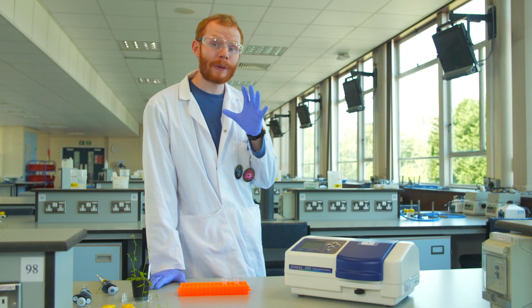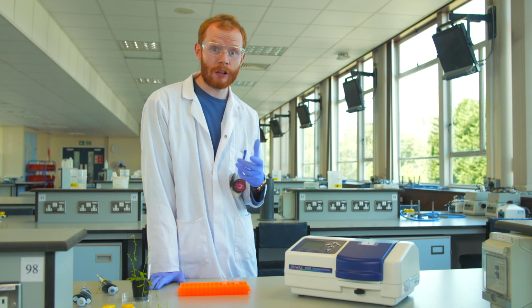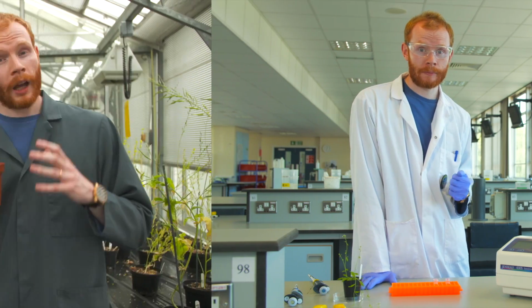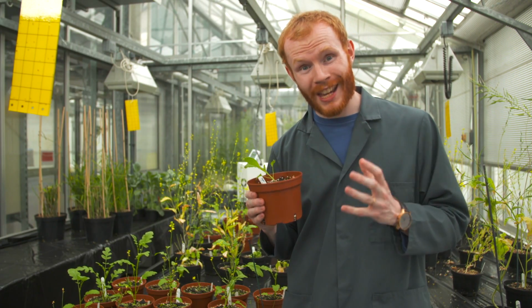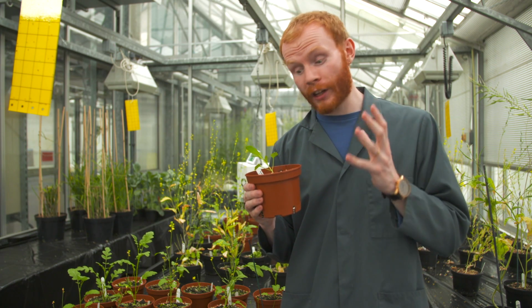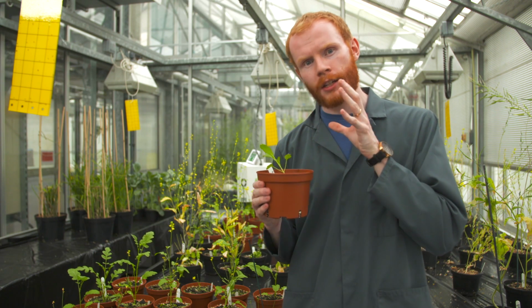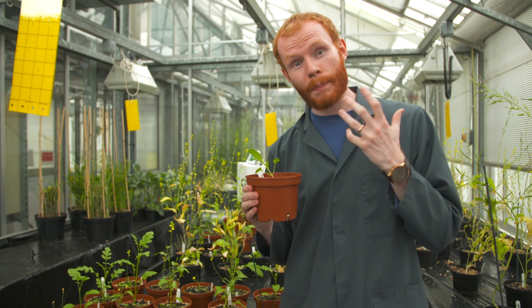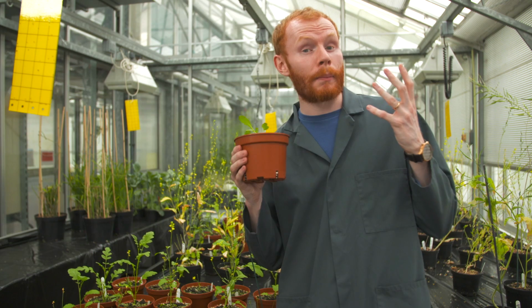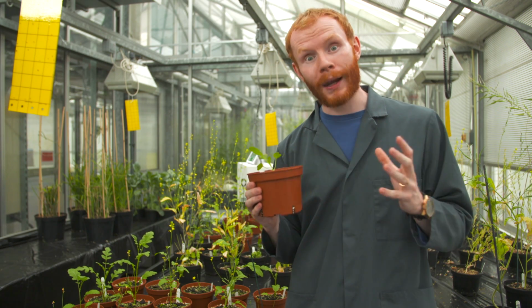Importantly, I want to repeat this experiment a number of times to ensure that my results are reliable. By looking at the pyrophosphatase activity under different conditions, this can help us to figure out how the protein functions in vivo, inside the plant cell, and can tell us a bit about how self-incompatibility is controlled and functions in plants.